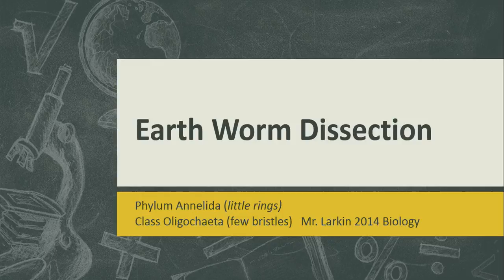You may use your drawings for the quiz, but not for the practical. You will not be graded on your drawings, but remember that you will be expected to identify all covered areas. It will be easier for you to learn the parts of the earthworm when you draw what they actually look like in front of you. Sometimes diagrams in books look a little different from what you'll be looking at, so be as descriptive as possible. Be sure to add color and try to be as accurate as possible with regard to scaling and size.